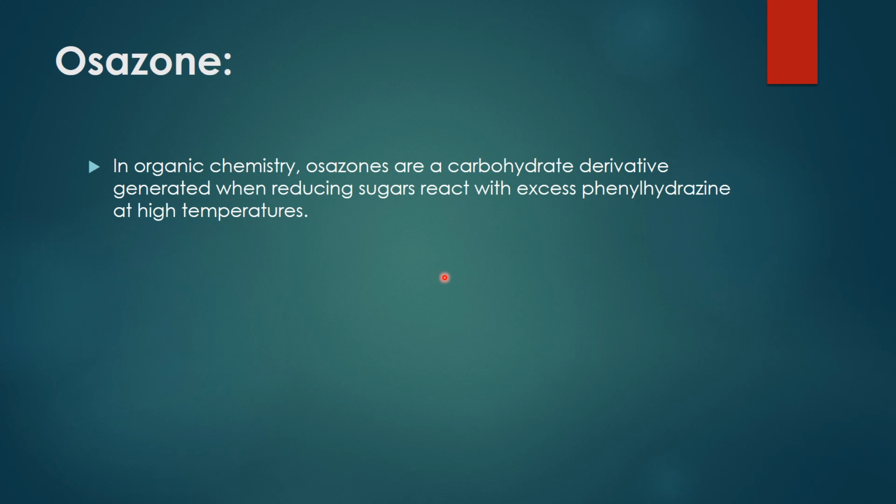So the distinguishing between the different reducing sugars will be based on the structure of the crystals and also the timing of formation of these crystals.